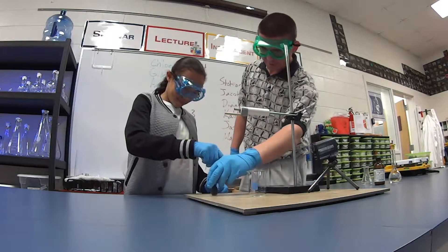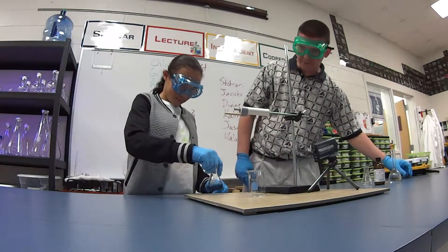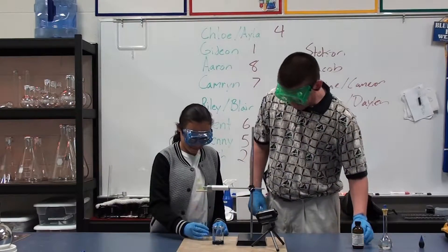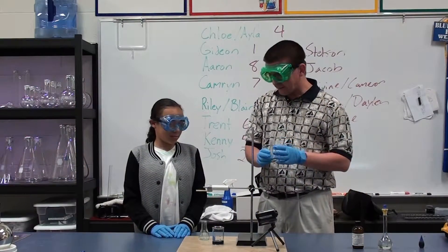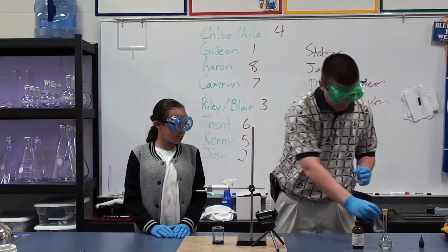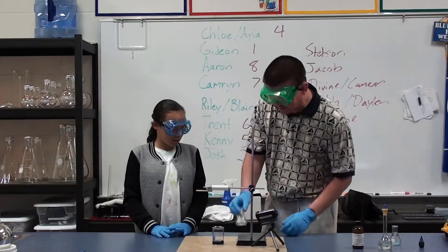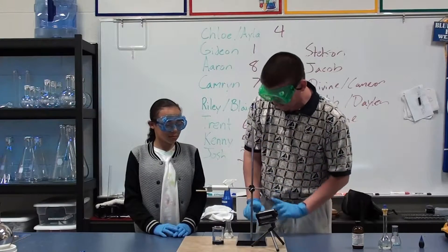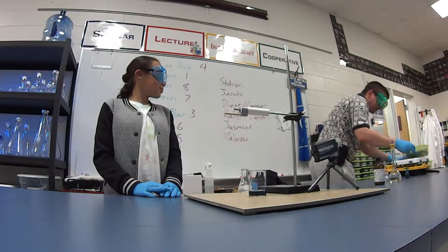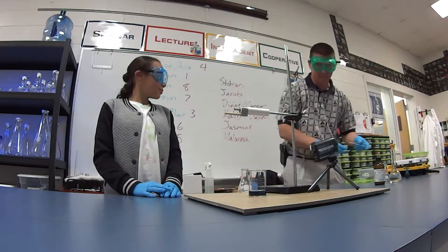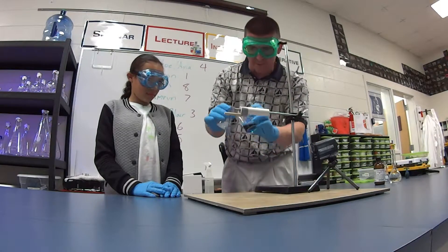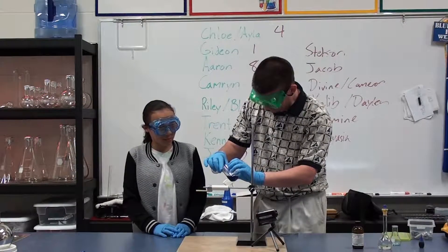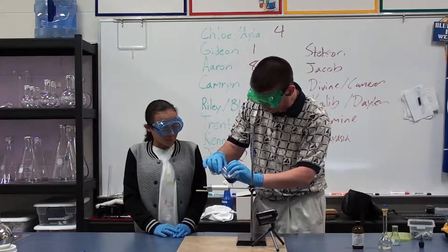If you want to kind of swirl that around a little bit and mix it in, then go ahead and pour it into our beaker when you're done. In just a minute we're going to add the sebacoyl chloride. We've also talked about density, and these two liquids have different densities. The hexamethylenediamine is more dense — it's going to stay on the bottom. When we add the sebacoyl chloride, it's going to float on top. I'm going to pour this very carefully because we don't want them to mix.